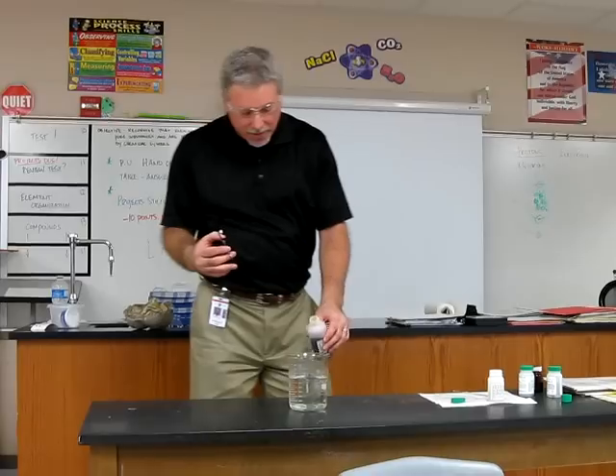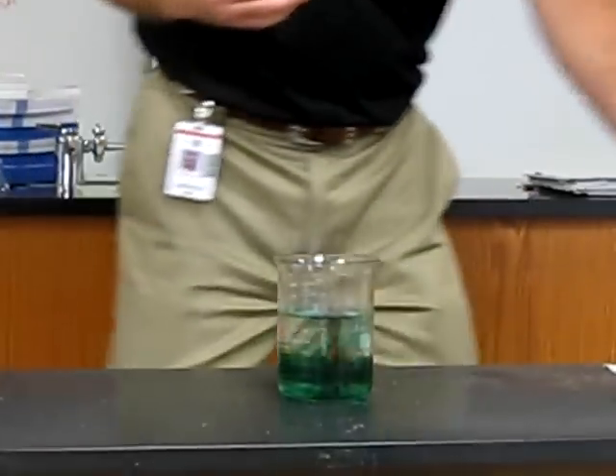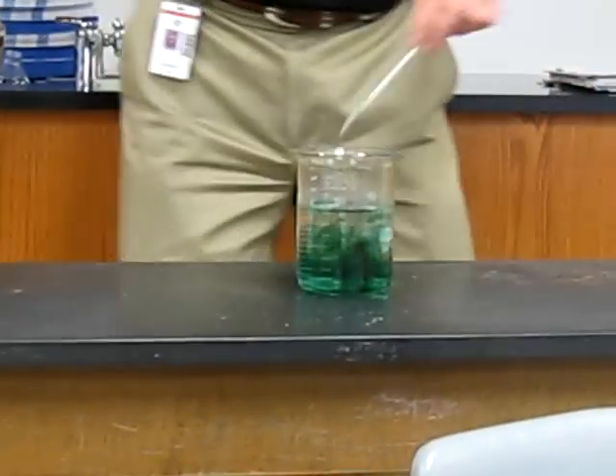This lets you know when a reaction is occurring, like if something turns into an acid or a base. So when I pour this in here now, it should be green. This is letting us know that it has a neutral pH.